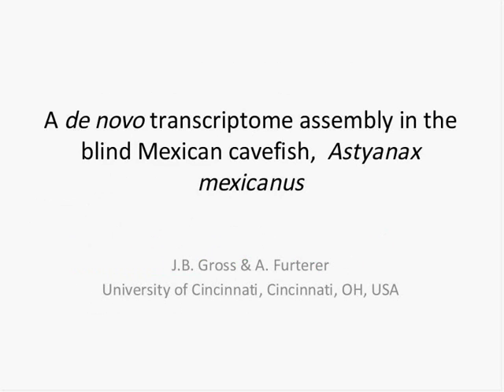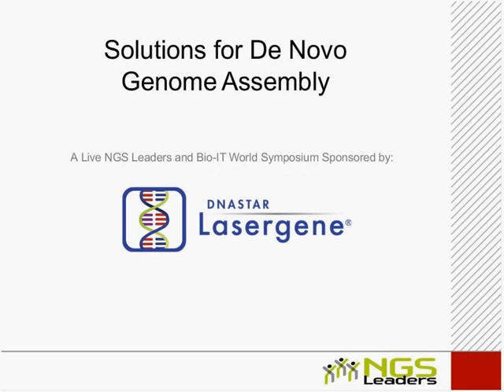That's a good question. I actually learned a lot of molecular biology and DNA sequencing analysis in particular during my postdoc, and the available software that we had there was DNASTAR Lasergene. And so the project really evolved out of interactions and conversations that I had with the folks at DNASTAR. And to be honest, I was very nervous about being able to, with my background, take on something that seemed as bioinformatically exhausting as a transcriptome assembly. But, really, as Ian mentioned in his portion of the talk, getting help from the folks at Lasergene has really been key for having the success that we've had, I think.